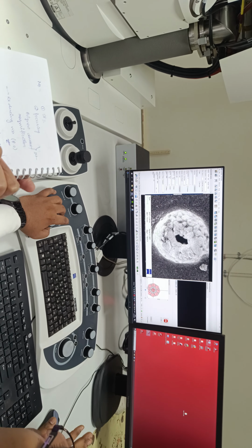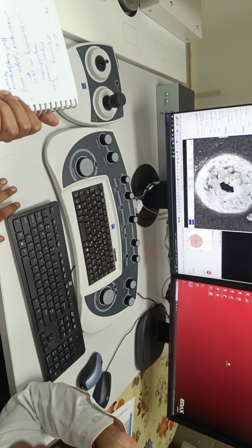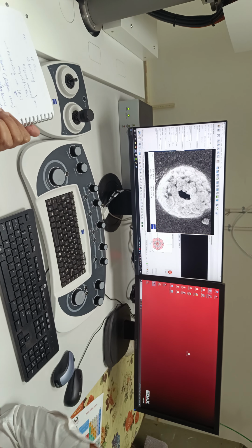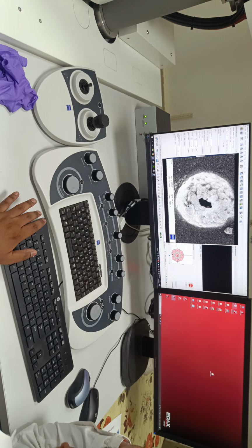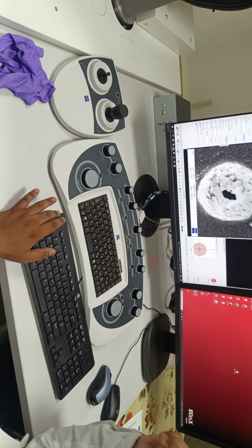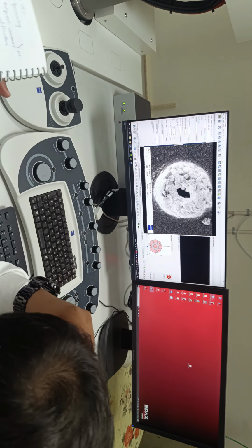So now I will show you the astigmatism correction, how it can be done. How is the astigmatism error generated, and can you recall why it is there? They have more than one wavelength, and the second thing is the thickness of the particular lens used. Yeah, you're very correct.